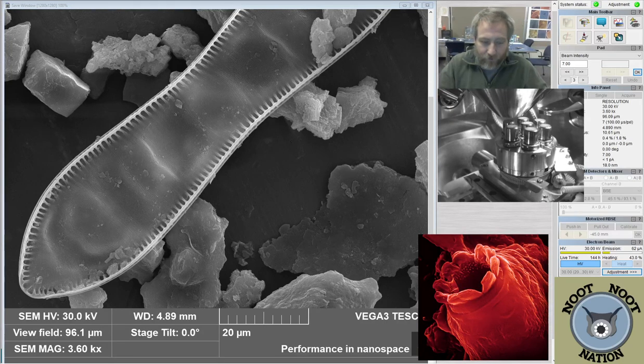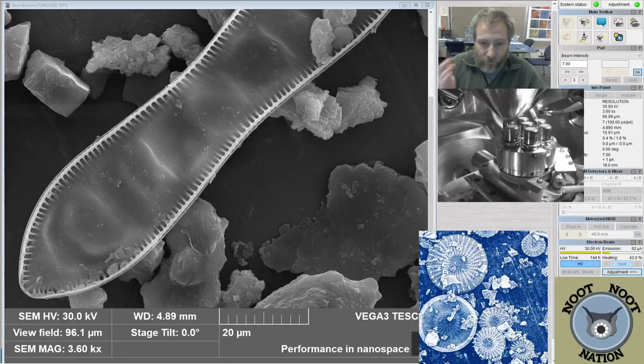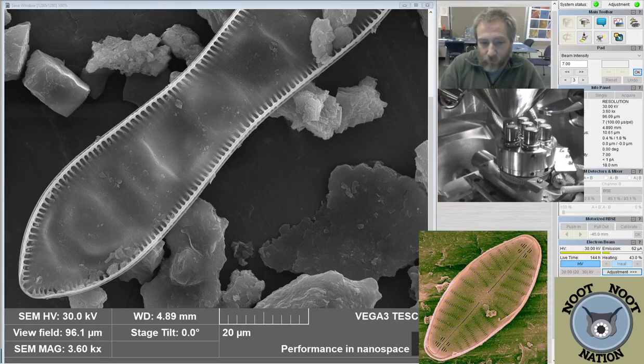So it will give us basically two bits of information, well, in many different parts, but some idea of what happened to the river over time. And two, we think that the water quality for the river has probably improved since the Clean Water Act and a number of the environmental polluters are no longer there along the river system. So we think that we could actually look at changes in water quality over time by looking at things like the diatom fossils that are recorded in those cores. So we're hoping to do some geochemical analysis on the sediments and then also analyze the diatoms from the system.